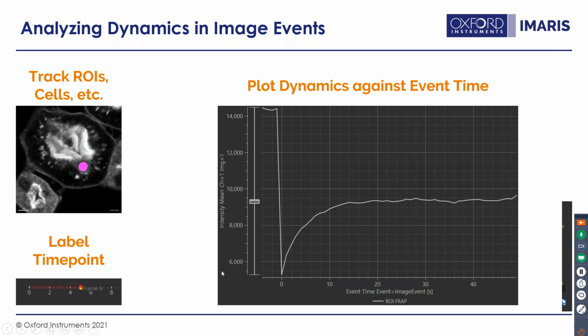And so this gives you a nice way of looking at those types of events, which traditionally Imaris wasn't used for. This does expand what Imaris can be used for, especially if you're in something like a core facility and wanting to have as many people using the same software as possible. This is a new thing for us. Okay.